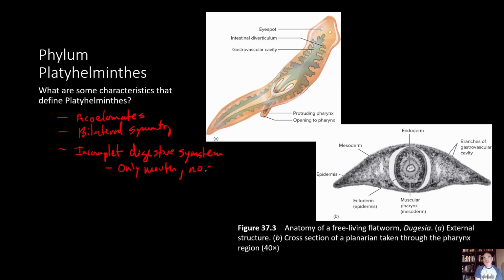No anus. So that would have something similar. We give it a similar name, a gastrovascular cavity here. And here would be the mouth opening going into the digestive system for this. By the way, what we see here, and you should come back to this to help you answer some questions later on.